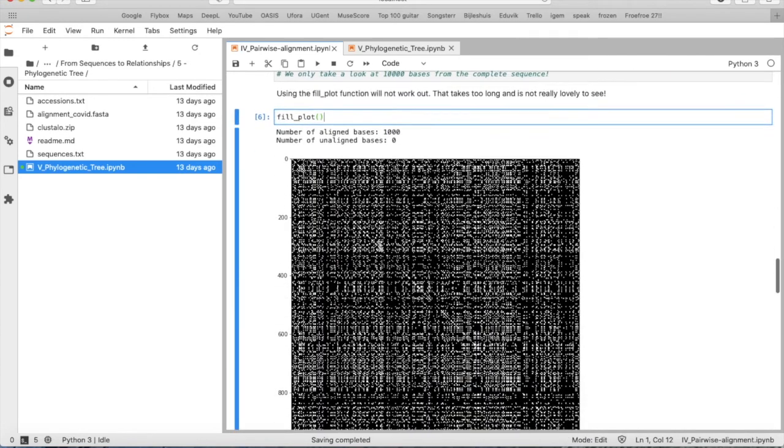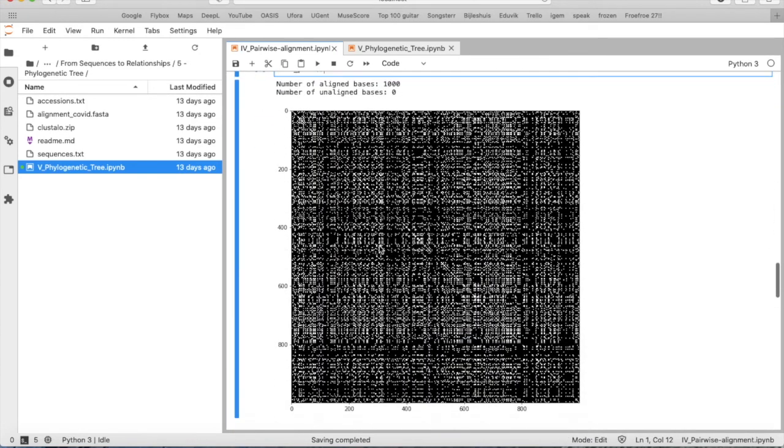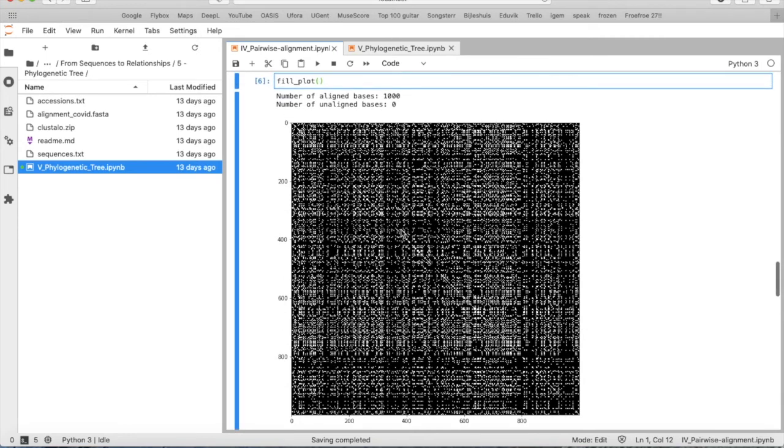And we see here a dot plot, a dot plot of those two sequences that we have chosen. And you see here the aligned bases are 1000. So the 1000 string of nucleotides from both sequences are the same.